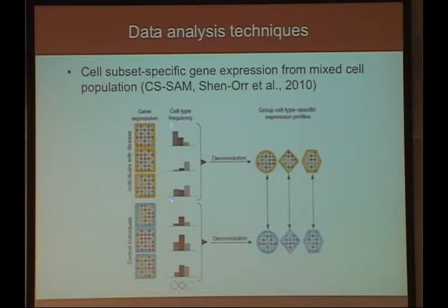So if you've done some kind of phenotyping of the whole blood at the same time point where you've done the gene expression, you can then mathematically deconvolve the relative expression of each gene in each particular cell subset. And Rob Tibshirani will tell you a lot more tomorrow about how that works, but it basically allows you to make comparisons at the cell subset level, even though you did your analysis on whole blood.